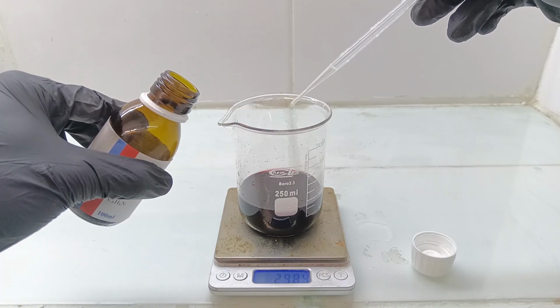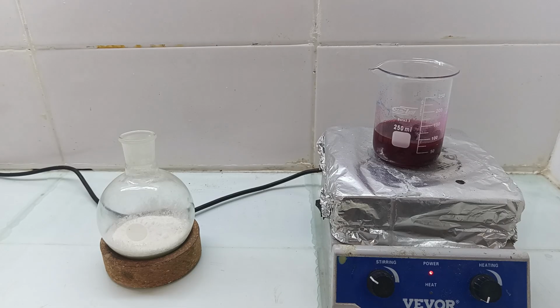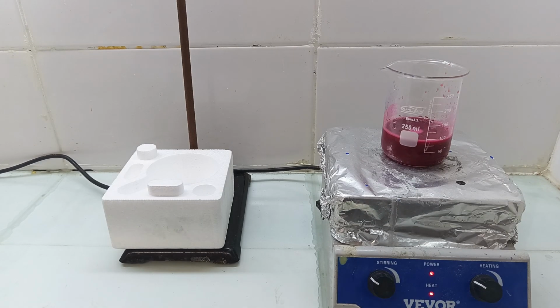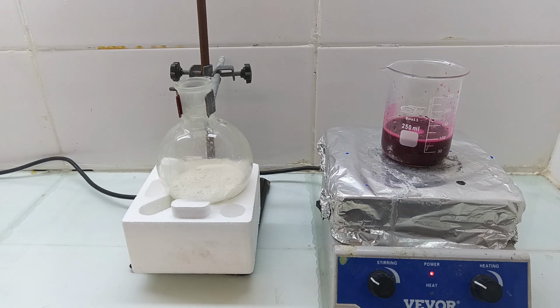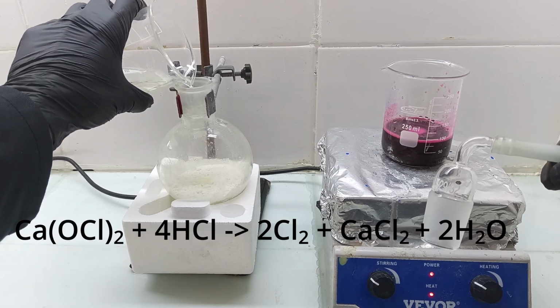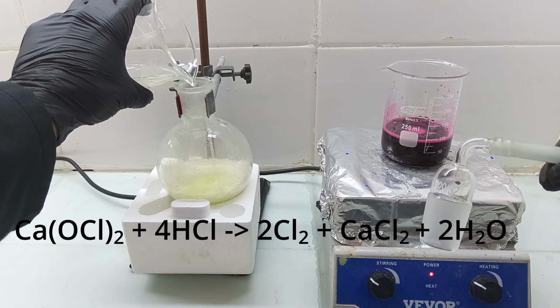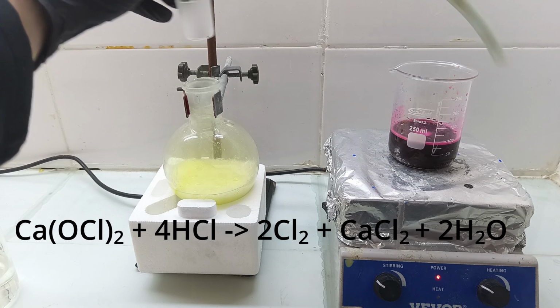After all the cobalt chloride has dissolved, I added 30 grams of pyridine. I let it sit for a few minutes, and just like the paper mentions, I have a pink-red precipitate. I put the beaker on a hot plate and heated the solution until all of the precipitate redissolved. When it dissolved, I put the hydrochloric acid into the calcium hypochlorite and attached a gas adapter to the top of the flask to bubble the chlorine into the solution.